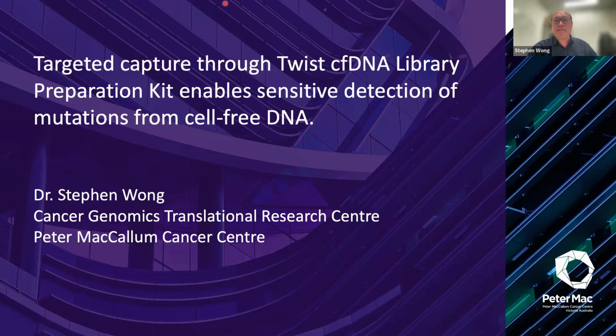So I'll do my best today to provide a bit of an overview of some of the research that we have done in this field of circulating tumor DNA analysis and how we've utilized the new Twist cell-free DNA library chemistry to improve our detection of somatic mutations for various clinical applications.